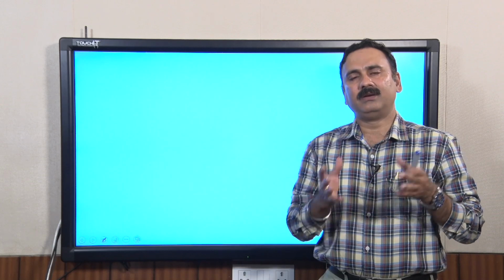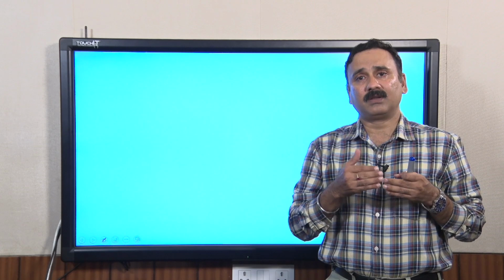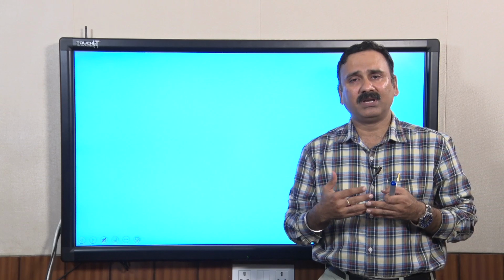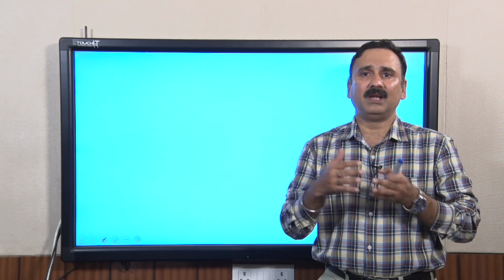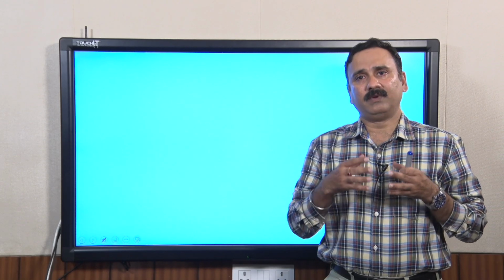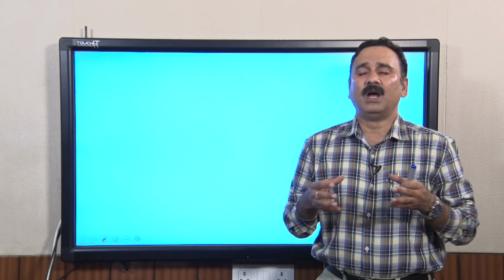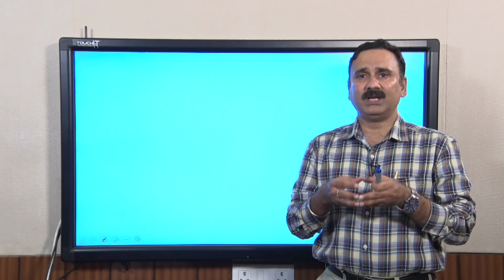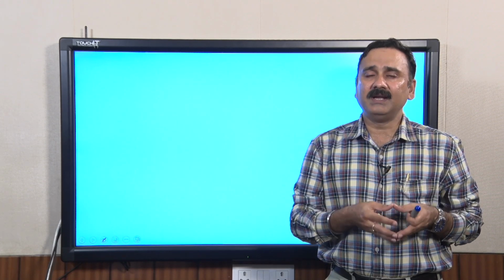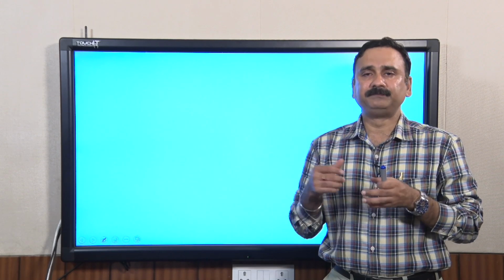In a detailed demo in the last lecture, we showed how the software can help you analyze that particular image, and how that analysis can help you answer many questions. So, in today's lecture we are going to discuss, once you are done with the image analysis, what different information you will get from that image, and how that information lets you characterize the proteins which we are going to purify using SDS-PAGE.